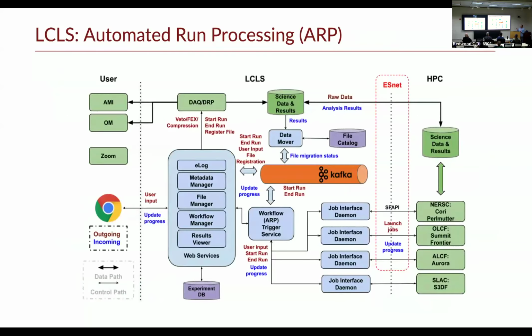This is a complicated slide, but let me guide you through this. What we did is we started manually our streaming, and then the streaming was received on the other side. But then we started thinking, why don't we integrate it with what we already have at LCLS? You saw in the talk from Vincent before that from the ELOG, you can trigger a lot of things. He showed the graphical interface.